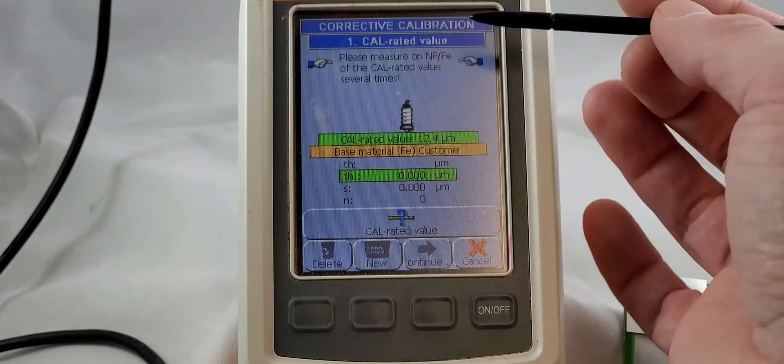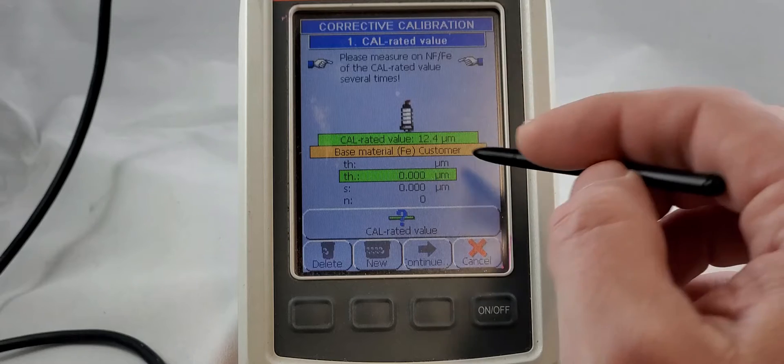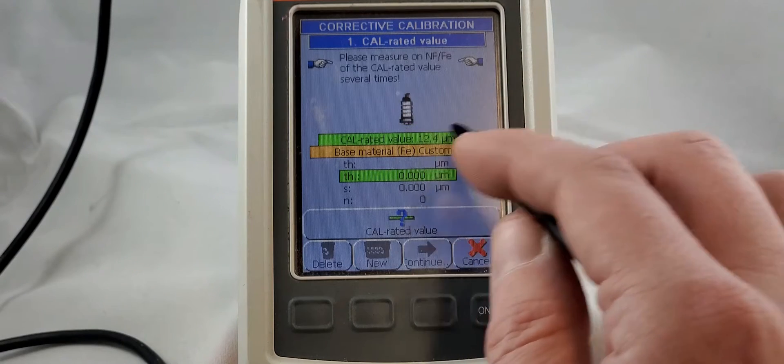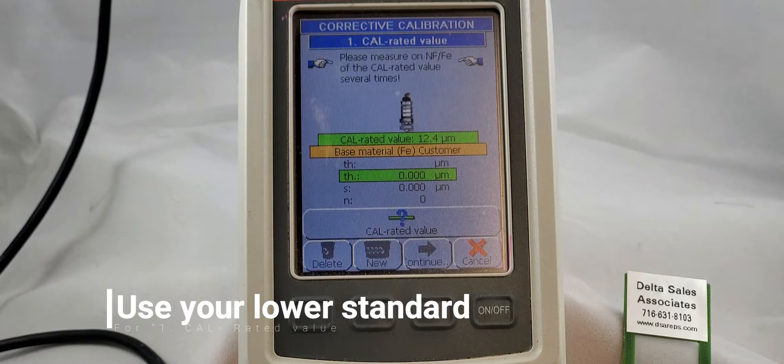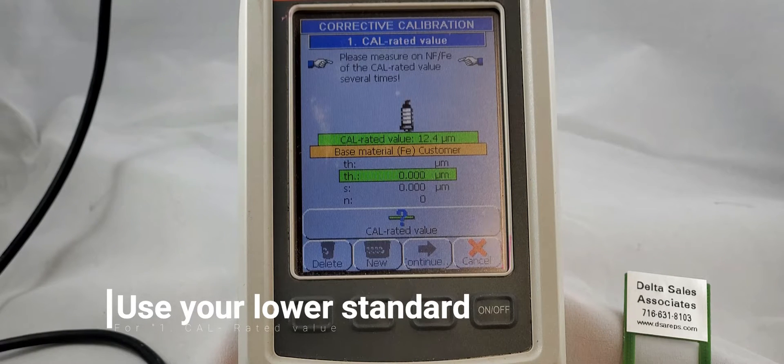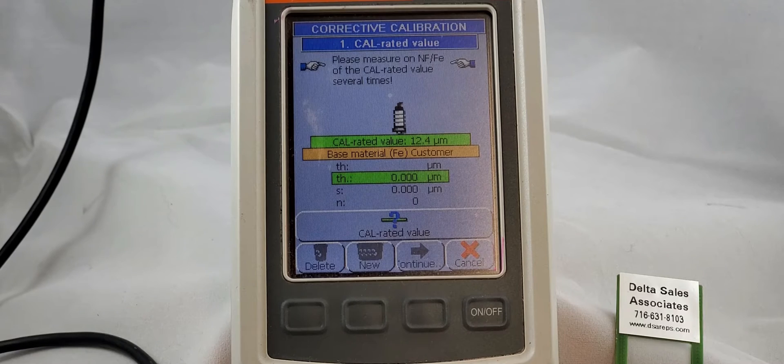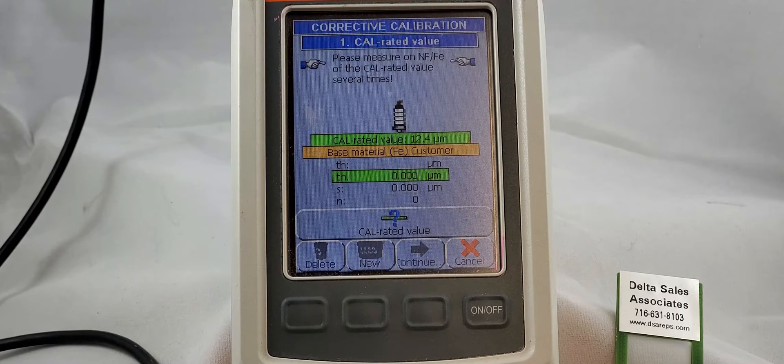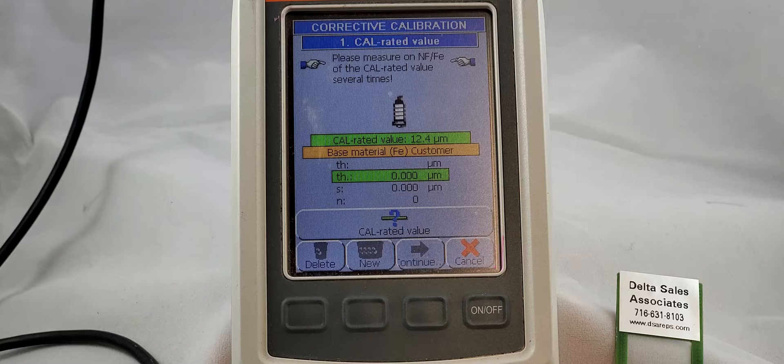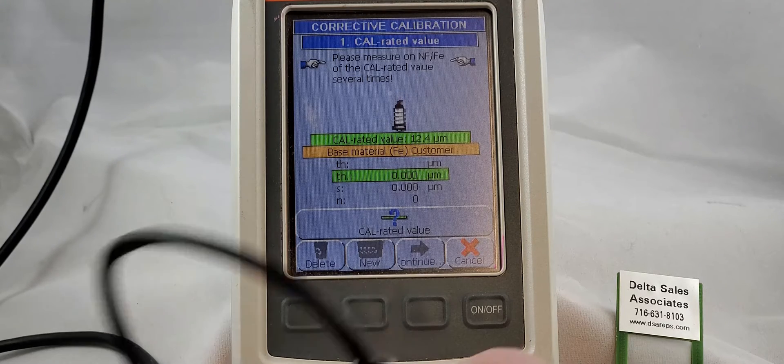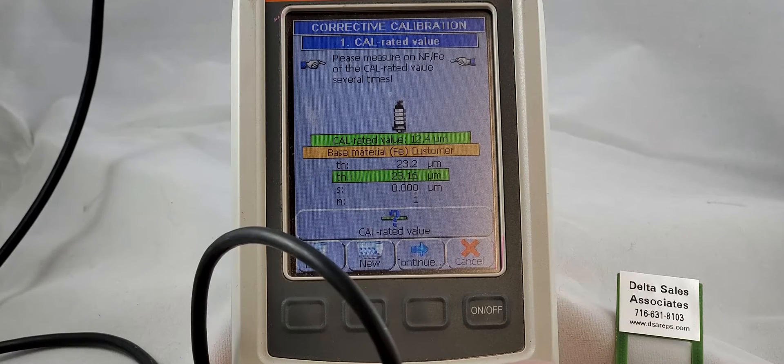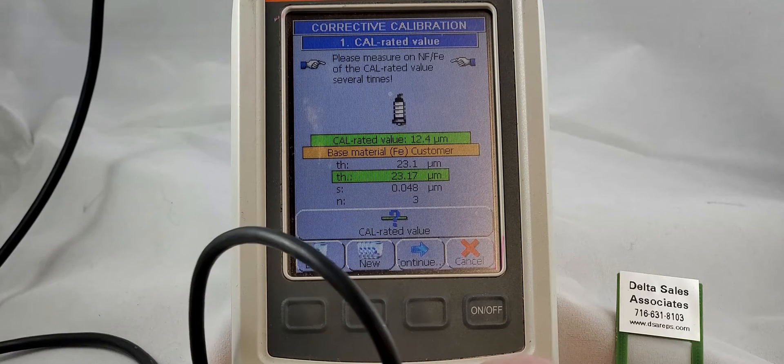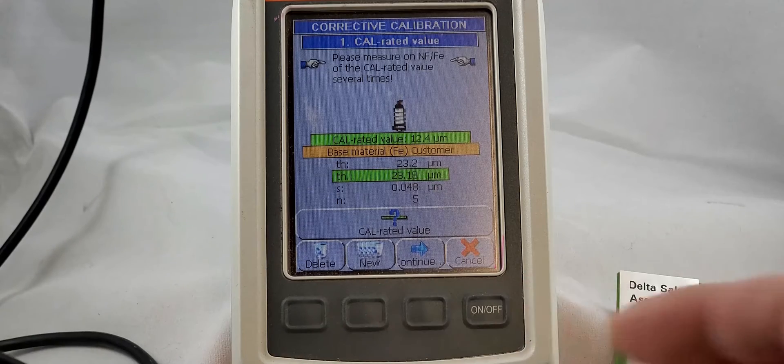And now it's going to ask for cal rated value. If you have previously used the same foils that you've got, your cal rated value may already be filled in. We are going to make sure that the numbers in the unit match the numbers that are on our foil. First things first, let's take five measurements on this. One, two, three, four, and five.